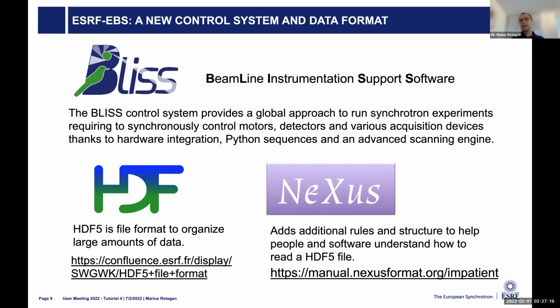So if you try to open them with something like Notepad on Windows, you do not understand anything inside. To actually visualize these files, you have to open them with dedicated visualization software, and PyMCA, which some of you might know, is able to open these HDF5 files.